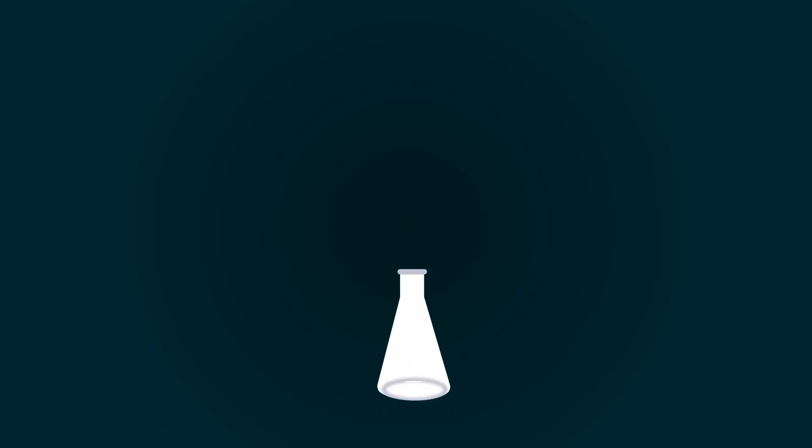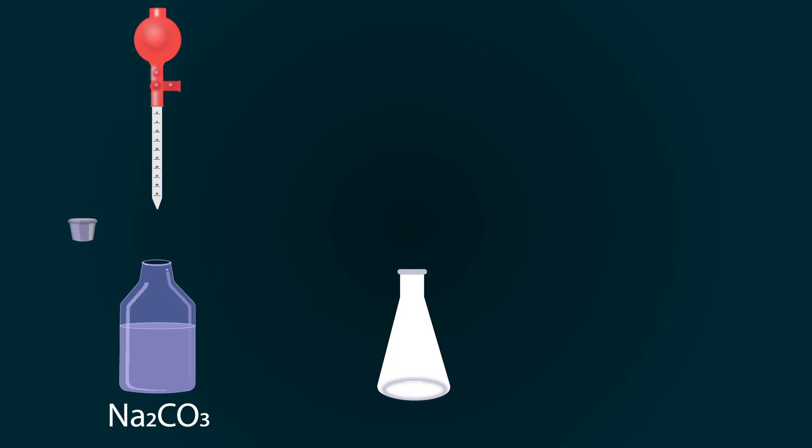Let's begin the procedure. First, take a conical flask and add sodium carbonate into it. You can add sodium carbonate into the conical flask with the help of a pipette. Pipette out 10 milliliters of sodium carbonate and put it into the conical flask.